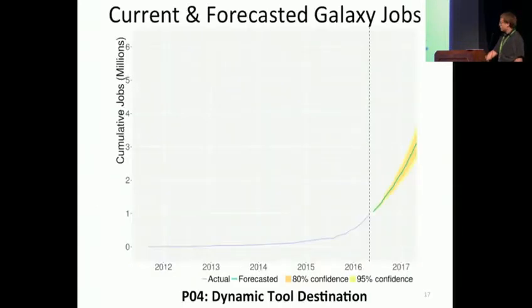This has all led to a large increase in the number of Galaxy jobs we're running. Again, we have multiple Galaxy instances at our sites, and because we're running such large workflows on many different bacterial genomes, for example, hundreds of genomes, and each of those workflows may run thousands of jobs before a result is produced, we've got a huge increase in the number of Galaxy jobs we're trying to manage, up to about 1 million right now.